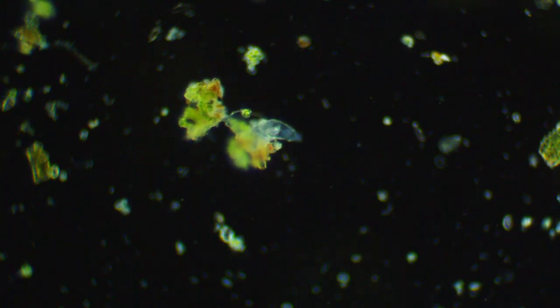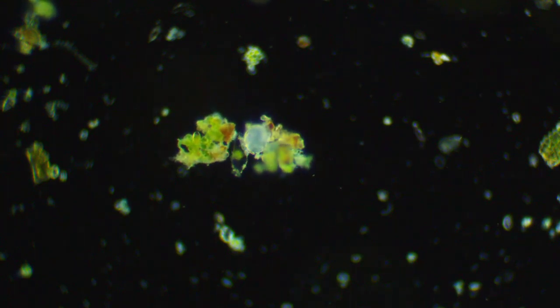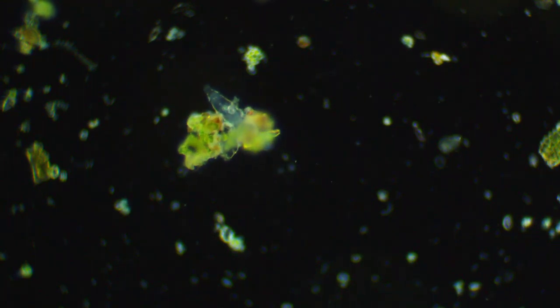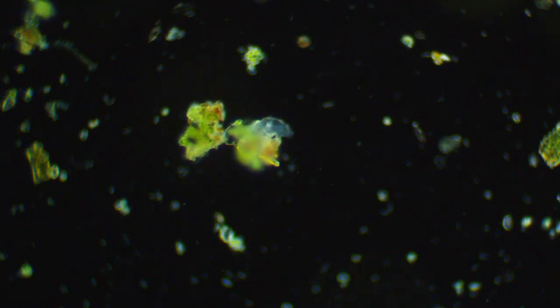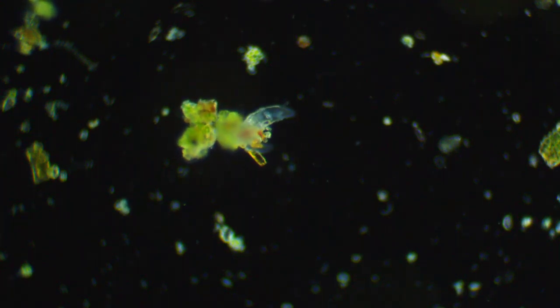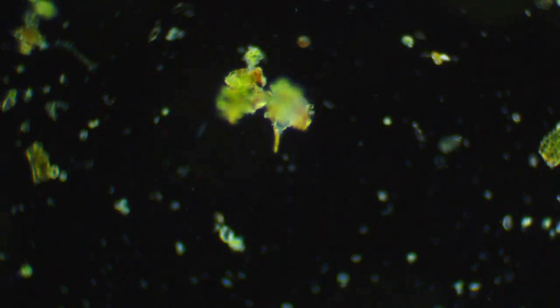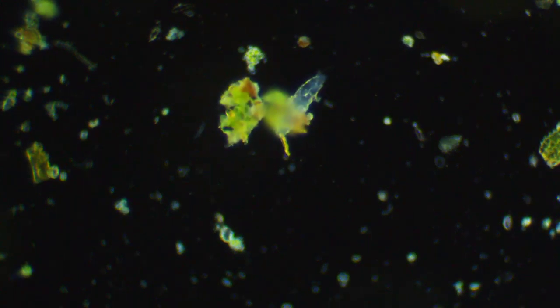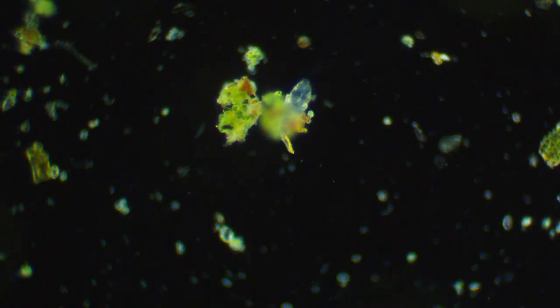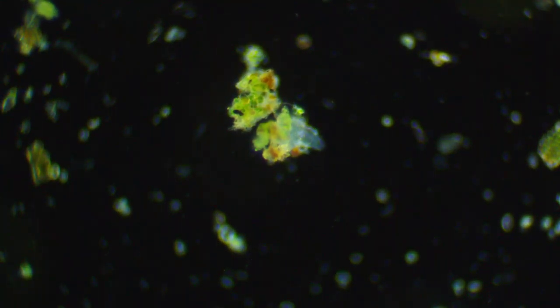Yep, another rotifer with junk stuck to him. See, I have to make sure, though, because every time I find one of these guys, just for a second, I go, is that a tardigrade? Because it's basically like this, but with legs and claws and eyes and a face. This doesn't have any claws or legs or eyes. It has a face.